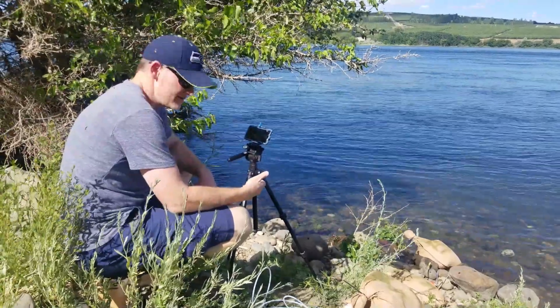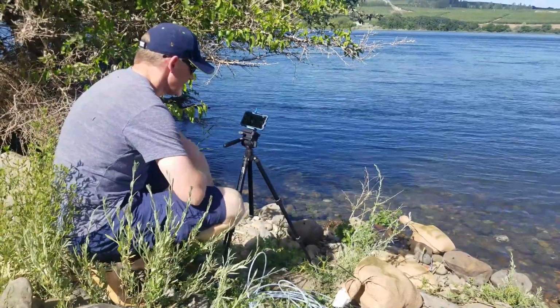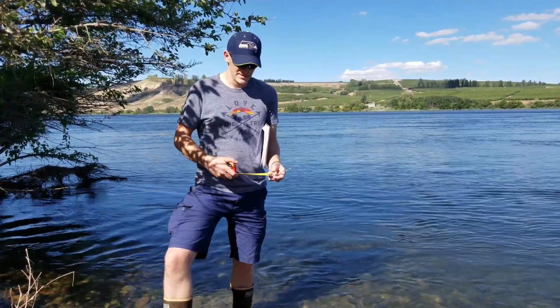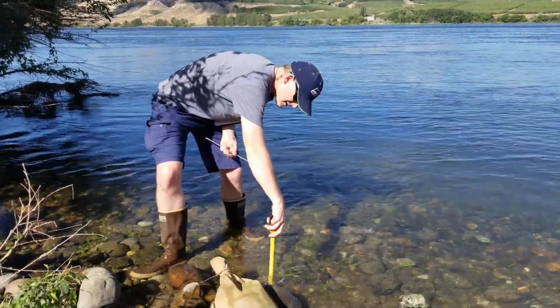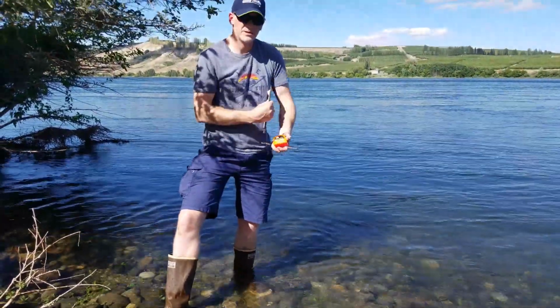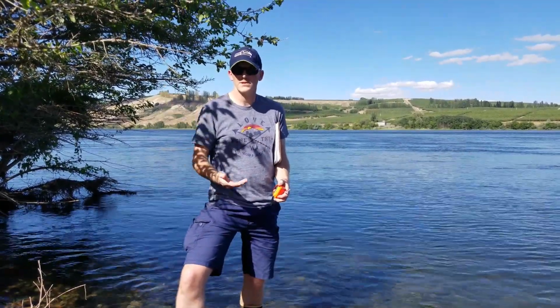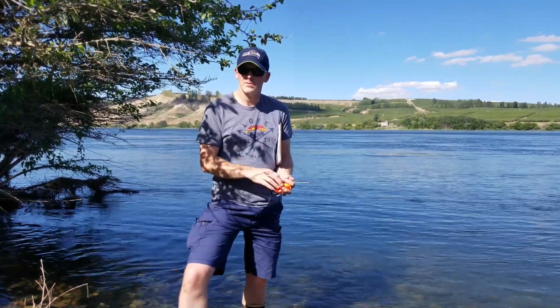A tripod here, that's what we'd recommend using if you have one available. Take your picture and hopefully just leave your tripod set up for the next shot later. Okay, one of the next things you want to do before you start sampling is take the depth of the water column at the middle push point. Take your measuring tape, get a measurement, make sure you record that on the data sheet, and only do this if it's clearly accessible. In some systems, if the stage fluctuations are too large, your push point may not be accessible, in which case don't take the depth measurement.